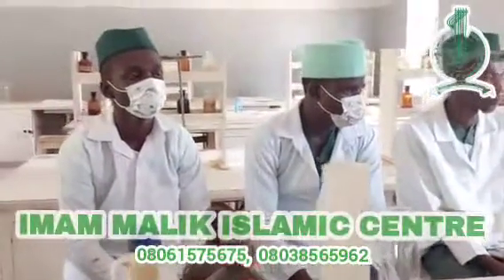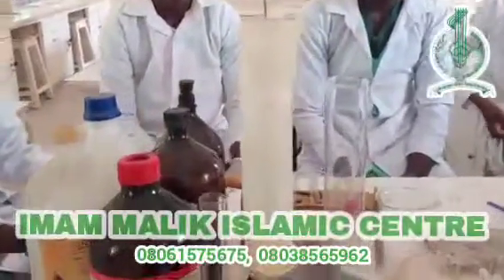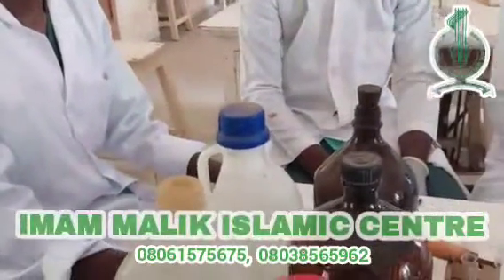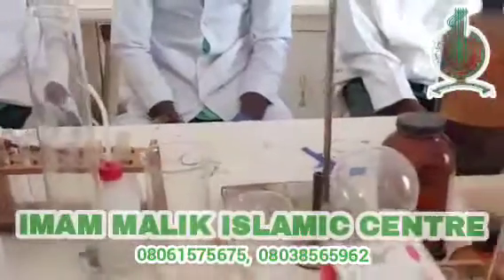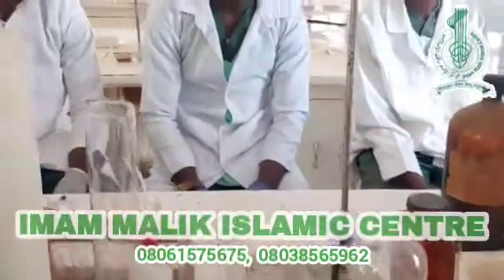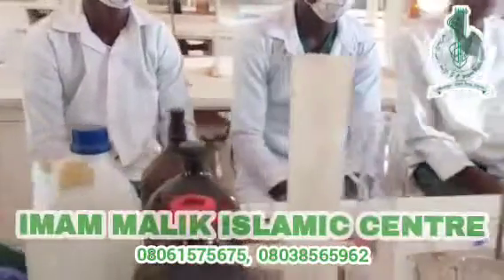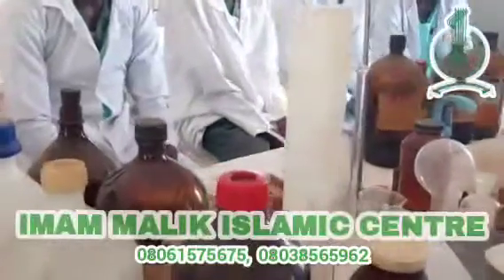So we are going to see the general precautions and the precautions on handling all the apparatus. Generally, once you are in the laboratory, you should keep your hands away from your face, your eyes, nose, mouth, and other parts of the body. Why will you do that? You should keep your hands away from your face, from your mouth, from your eyes, and the rest.